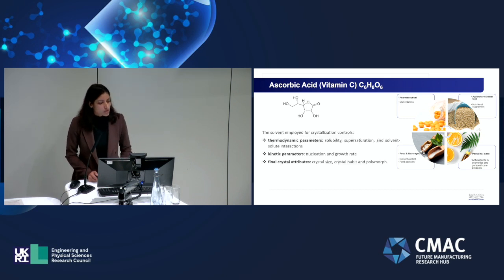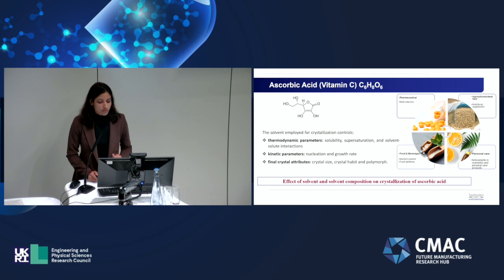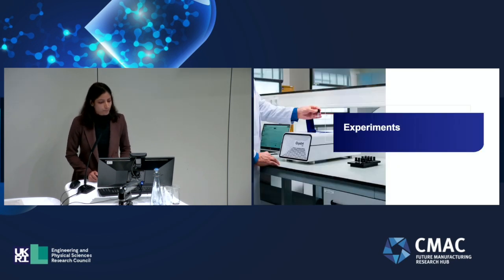important? Because the solvent employed for crystallization controls the thermodynamic parameters like solubility, supersaturation, and solid-solvent interactions, then kinetic parameters like nucleation and growth rate kinetics, and final crystal attributes. The solvent employed for crystallization will control the crystal size, crystal habit, and polymorph. Therefore, this case study focuses on the effect of solvent and solvent composition on crystallization of ascorbic acid.